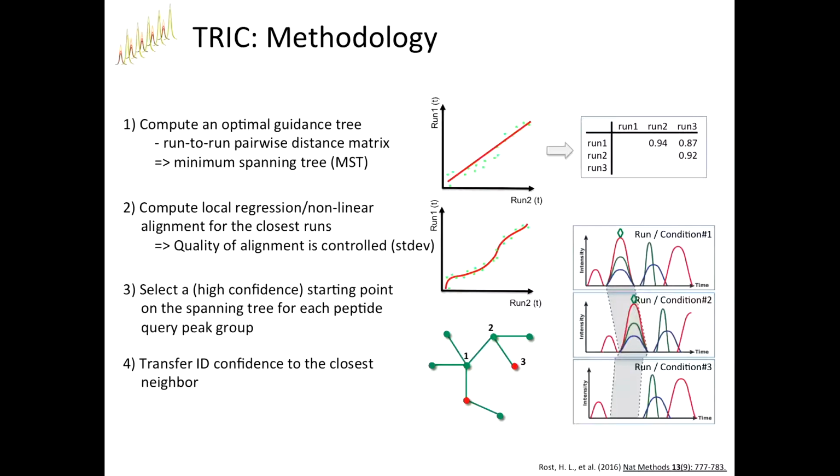The next thing that you can do is revisit nodes where you didn't find a peak group. So here you can imagine you don't have this peptide peak group detected, and you can go back there and integrate the noise at the specific retention time that has been aligned, and this can then be used as a background noise to be able to calculate fold changes at the end and to have a complete matrix.